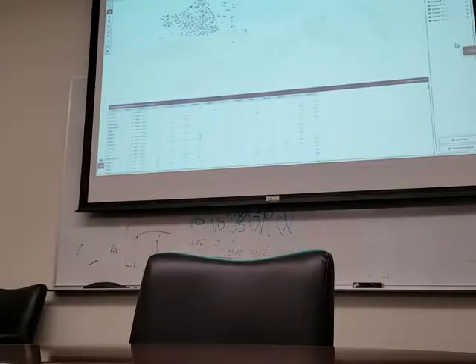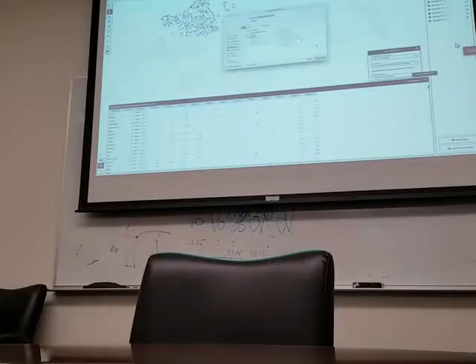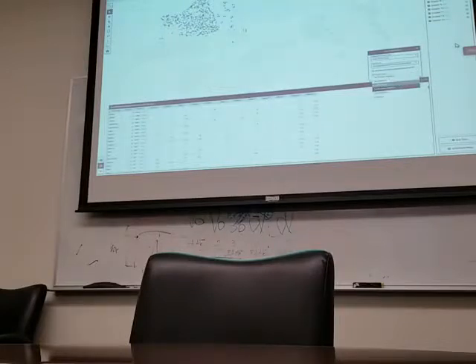Can you export it? Yes, when you go to this little icon here, this exports the table. Which icon? There's a little arrow here. Yeah, little arrow. Okay, export table. Oh, I see, to CSV. And you can specify if you just want, say, the top 50 genes, or top 10, 20, 50, 100, or all of the genes. Oh, that's good.